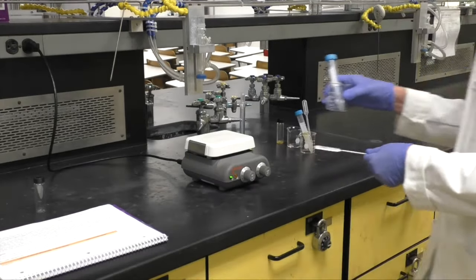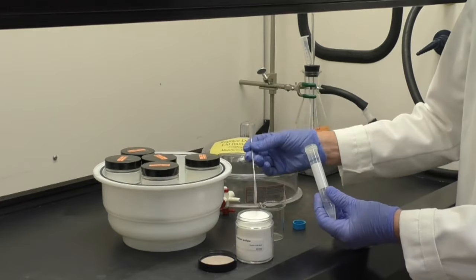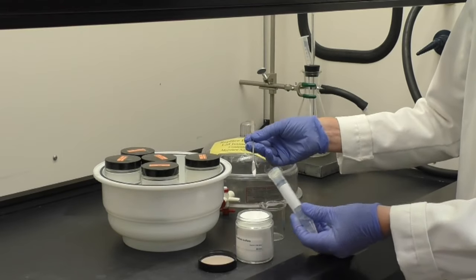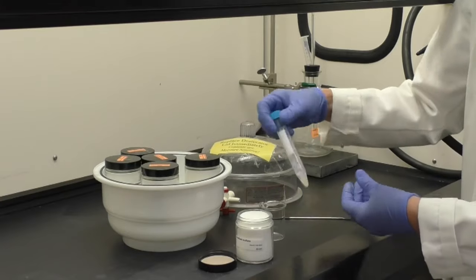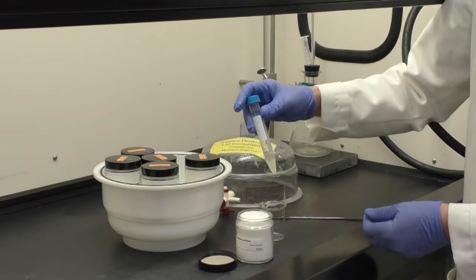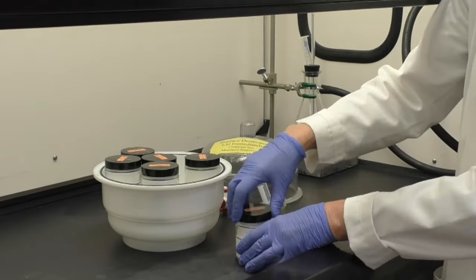Going back to your original centrifuge tube which contains the limonene, add a spatula tip full of sodium sulfate. Cap and shake vigorously to remove any water.